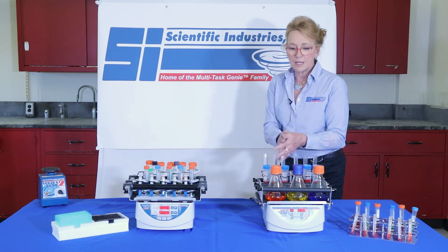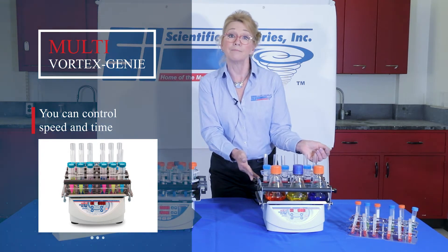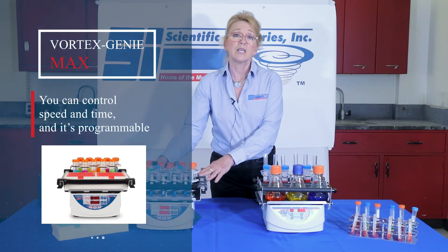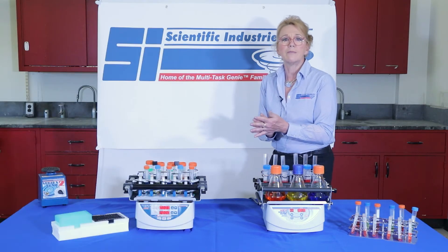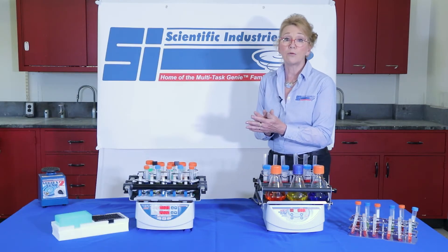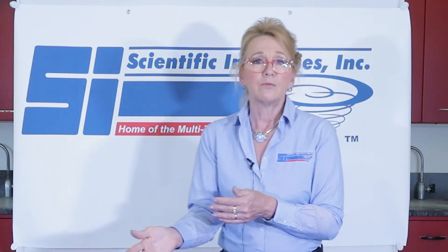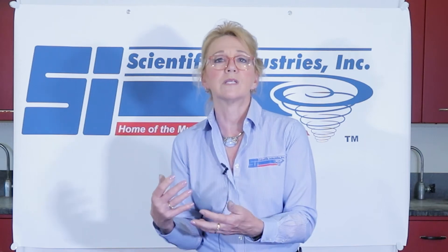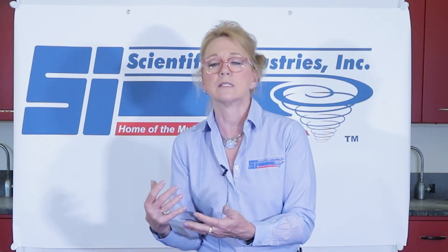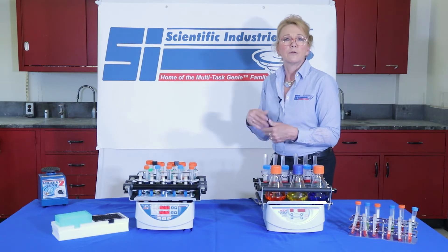That being said, the Multi Vortex Genie allows you to control the speed and the time. In the Vortex Genie Max, you can control speed and time, but you also can program. The additional programming capabilities include pulse mode, which is an on-off for total cycle time, and we also have reverse mode so that you can go clockwise vortexing and then counterclockwise, allowing for a more vigorous and homogeneous mix. We also have a normal run for total time.